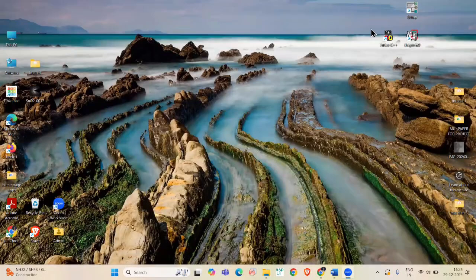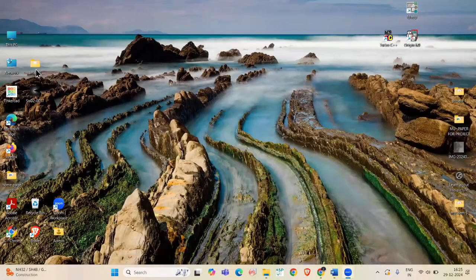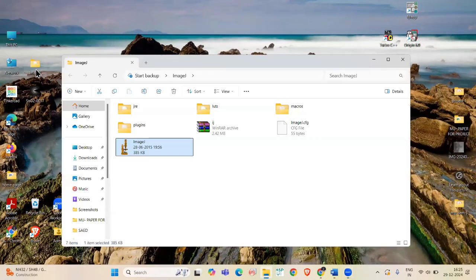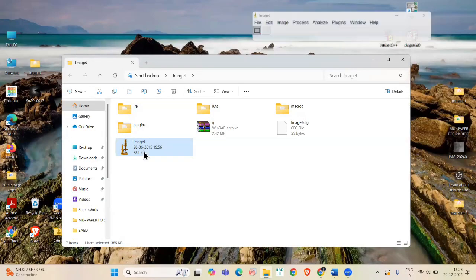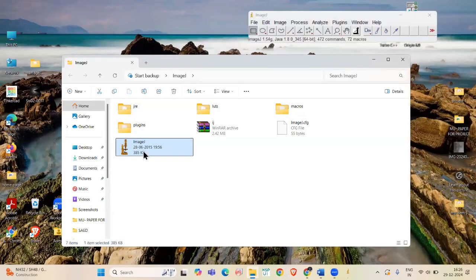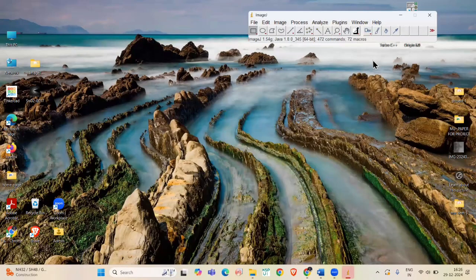Let's get started. First, open ImageJ on your laptop. If you haven't downloaded it yet, you can download it from its official website.